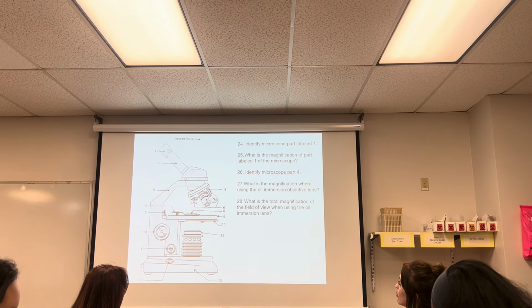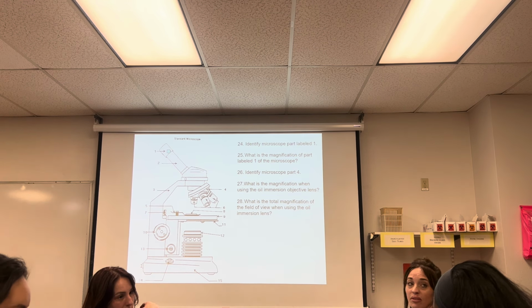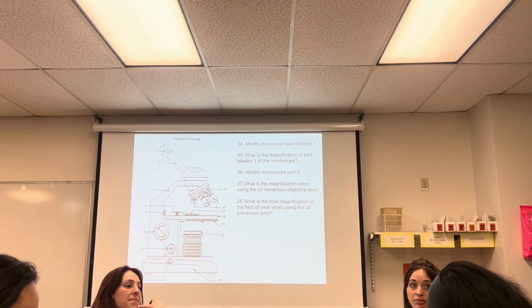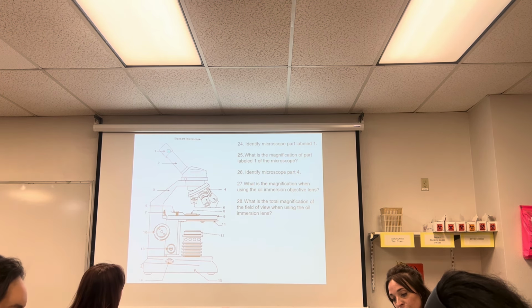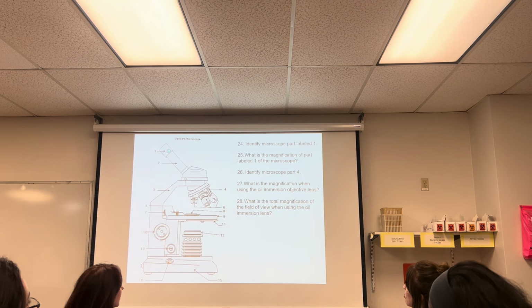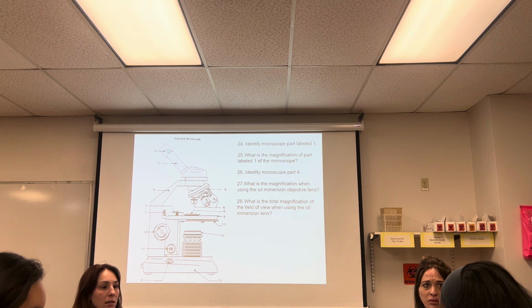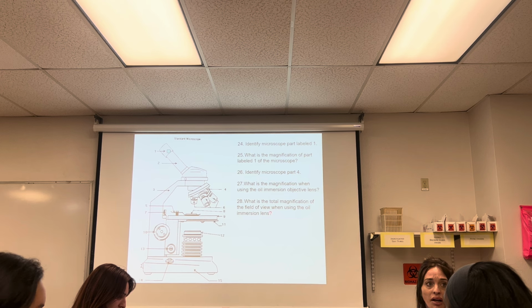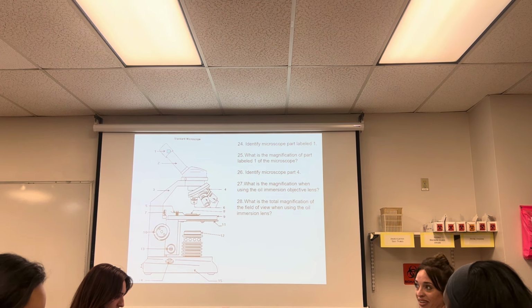So now, what is the part labeled 4 called? Rotating nosepiece, or just nosepiece is fine. Okay, so now these things are called what? Objectives or lens. Either one. Now lens is okay, because that's its primary function. So what is the magnification of the oil lens? 100 times. But what's the total magnification? 1,000. Why is this going to be hard? That's what I'm asking.